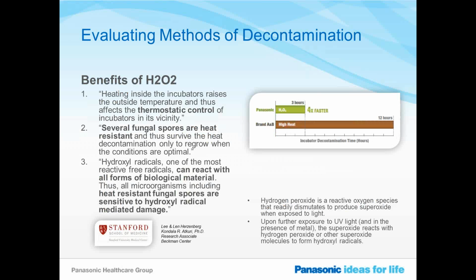And then I wanted to touch a little bit about decontamination. This is a recurring theme. We discussed a little bit about it last time. And Panasonic does have a different technology.